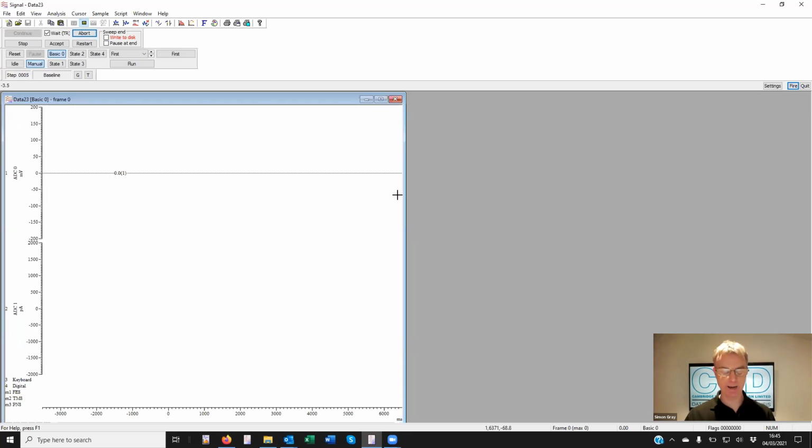That data can now be handed back to the script before I've started sampling. So the script can then perform some analysis on the data to work out what the mean level is and its standard deviation, from which it can then decide whereabouts to put the threshold that needs to be crossed before it produces some stimuli.